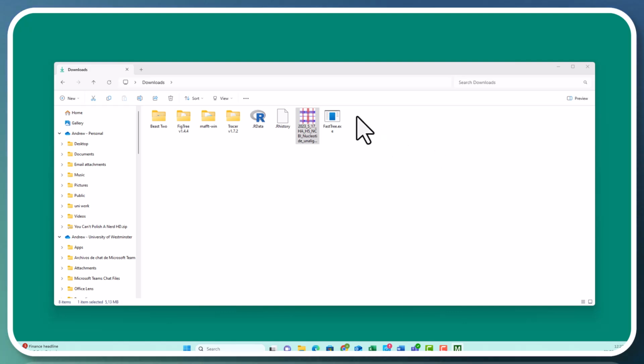I wouldn't download it if I didn't care about it, because I might want to ask questions to do with which species it comes from, or what year, or what location. Any of these questions, if I've just got the IDs, then I need to go and find a reference table which then will tell me what each of those IDs mean. This is difficult and time consuming to look up. It's much better if I've got the file sorted out in the first place.